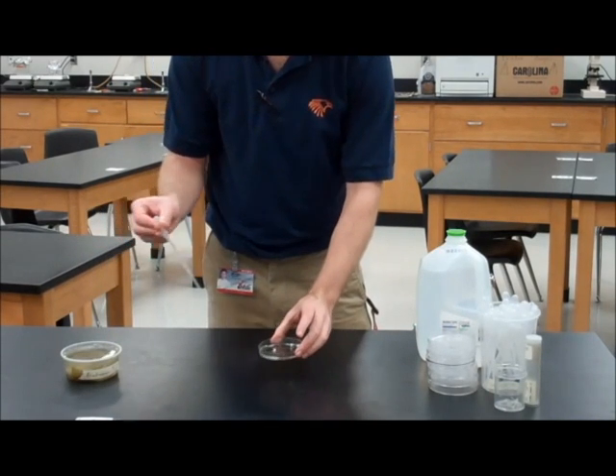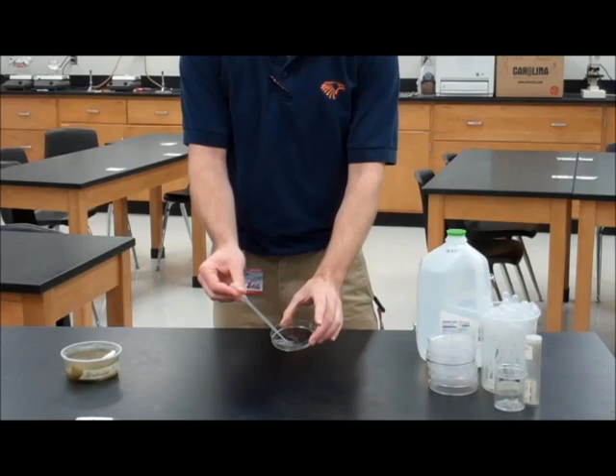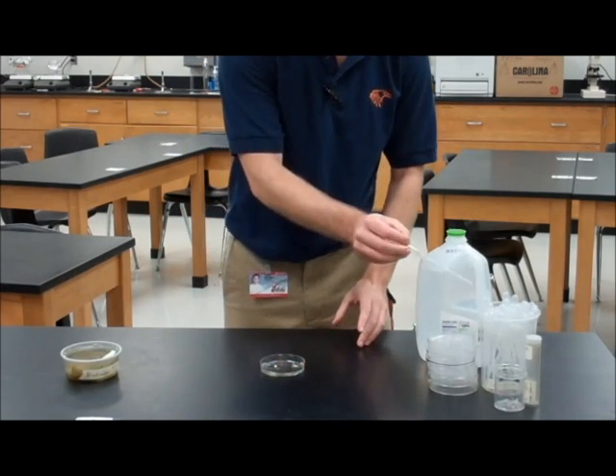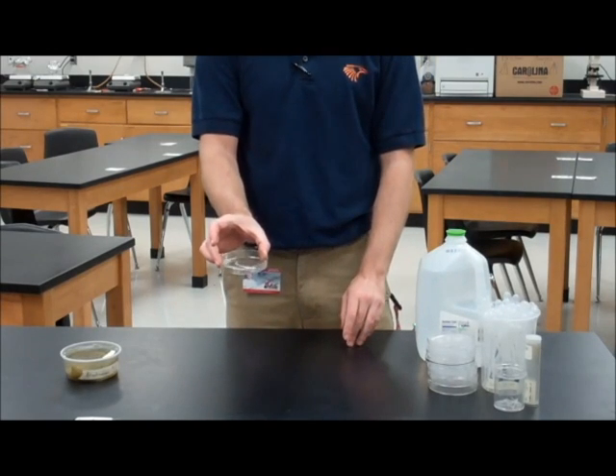Remember, they like to hide underneath cover, but if you look hard enough, eventually you should find one. Then squirt your black worm into their new transport puddle.